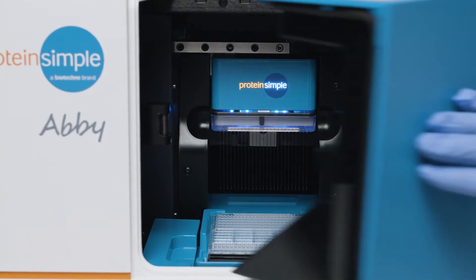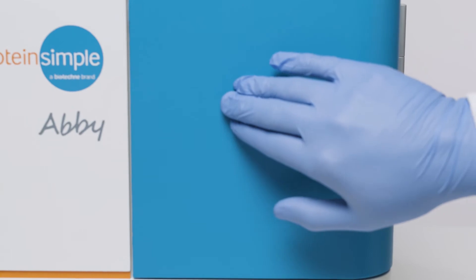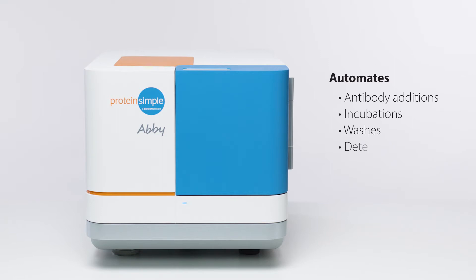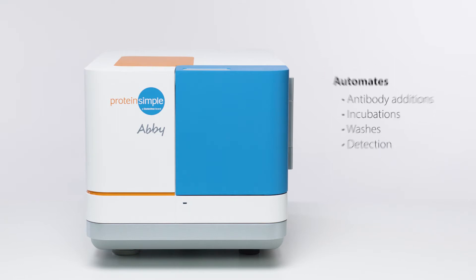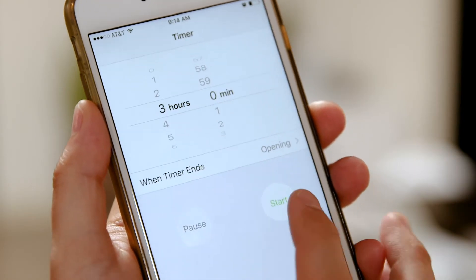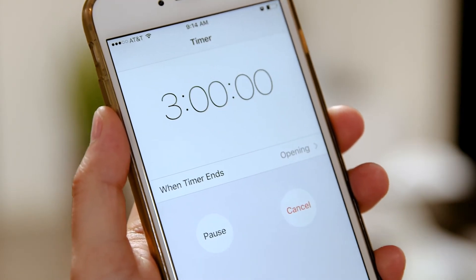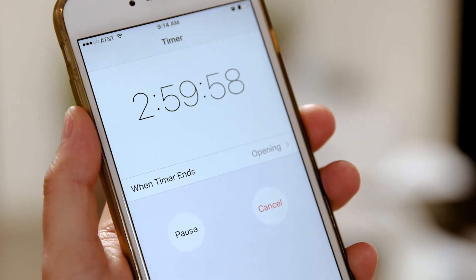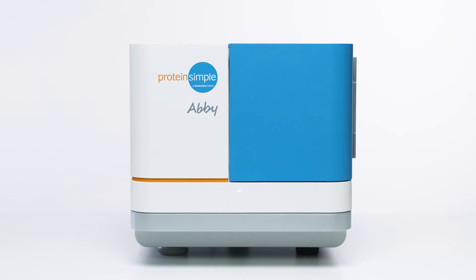She separates your protein by size and precisely manages antibody additions, incubations, washes, and even the detection steps. Come back to fully analyzed, quantitative results in three hours.